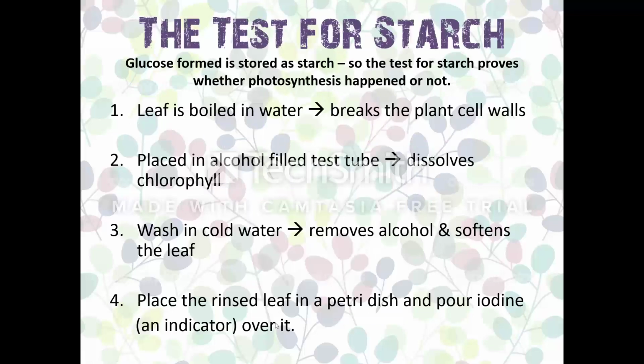Fun. Okay. Right, so before I get into all the hectic detail about the different factors that we can test, I'm going to just talk about how we test for starch. So this is revision of grade 8 work. Sorry about that little break in there. I don't know why it happens to me every single time, no matter how many times I've done these videos.